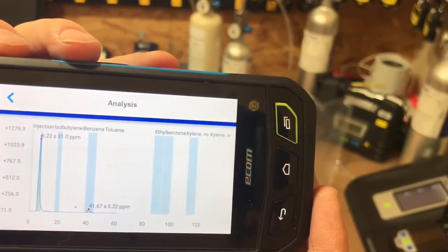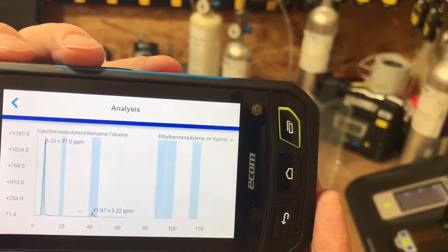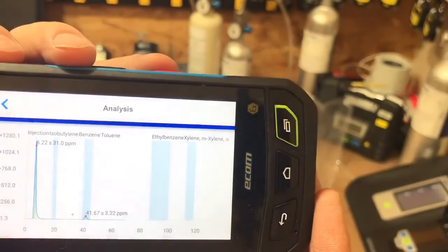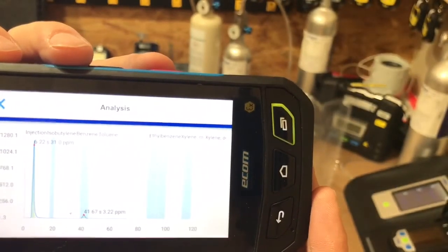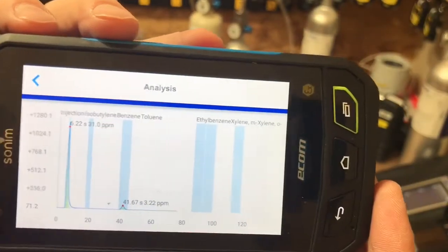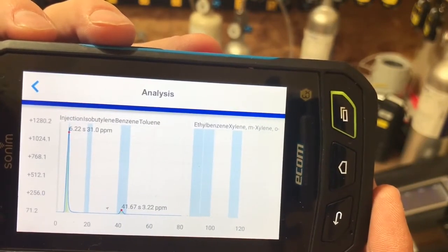Everything can be downloaded and emailed or using a thumb drive going directly into your computer after it's done. It's just rolling along, so for all those compounds on one run, you're talking about just a few minutes.